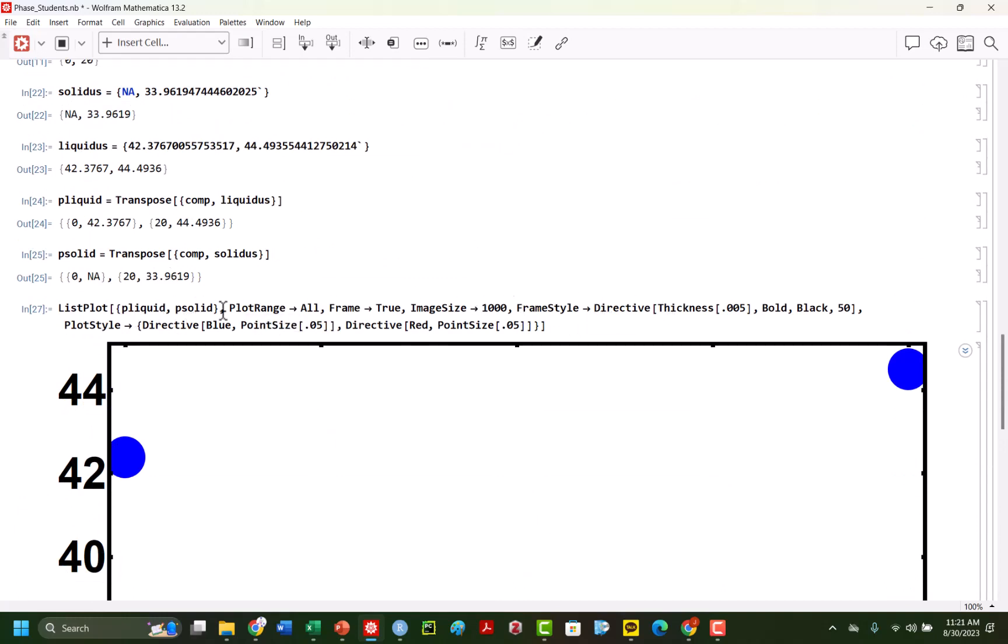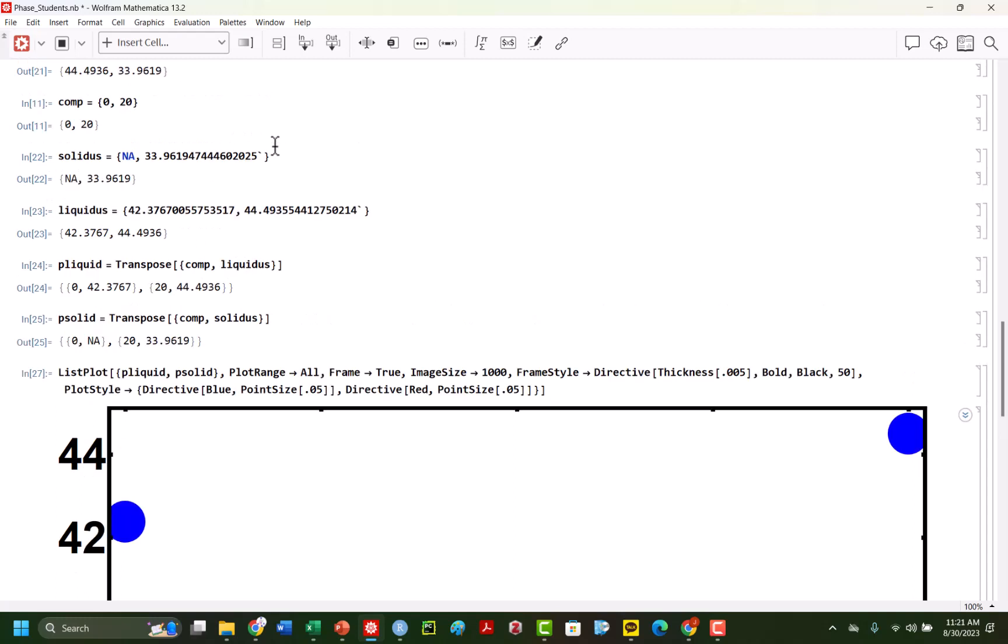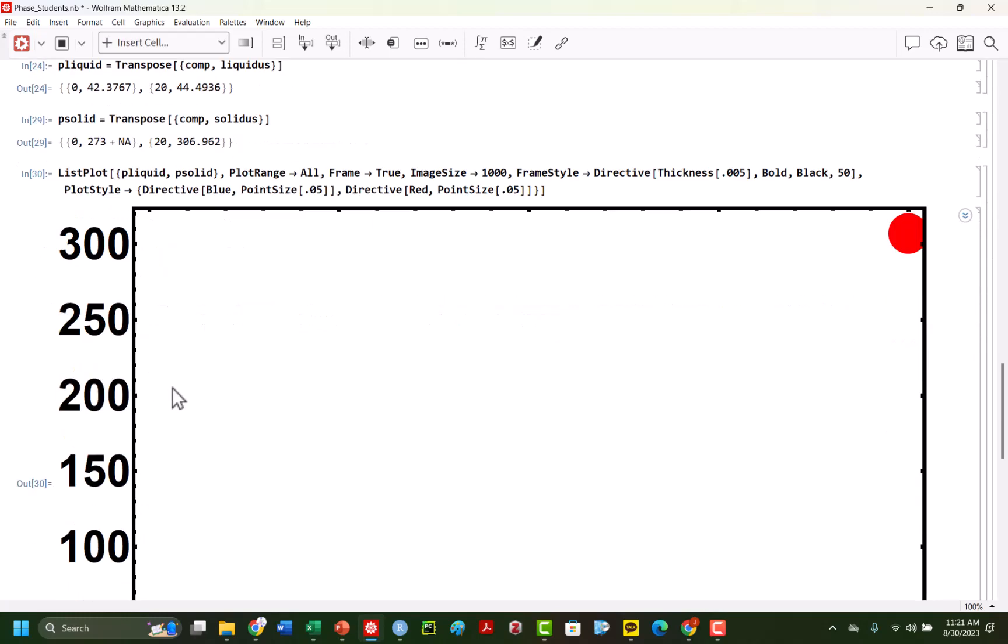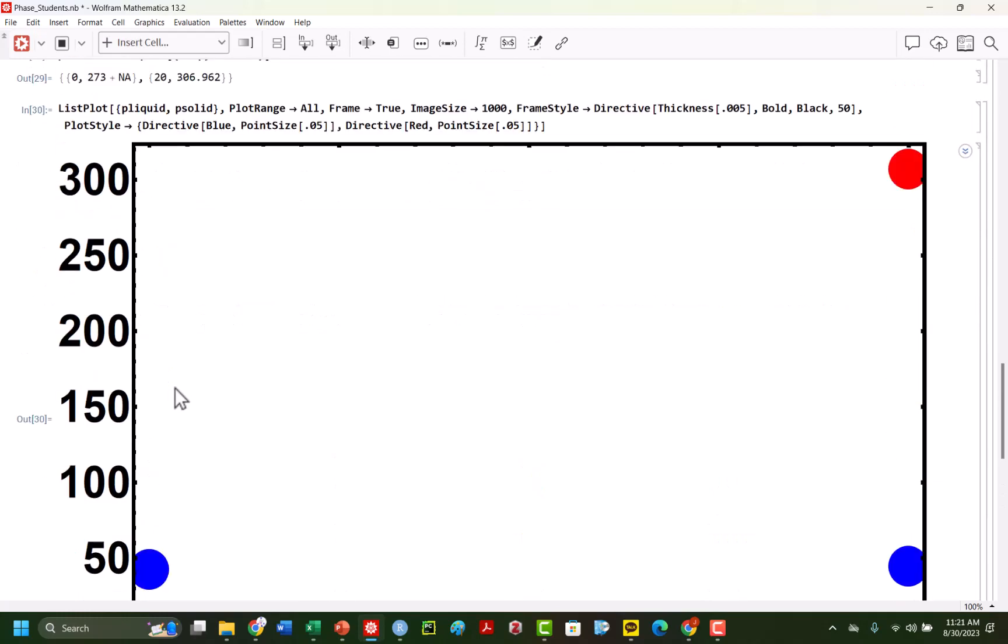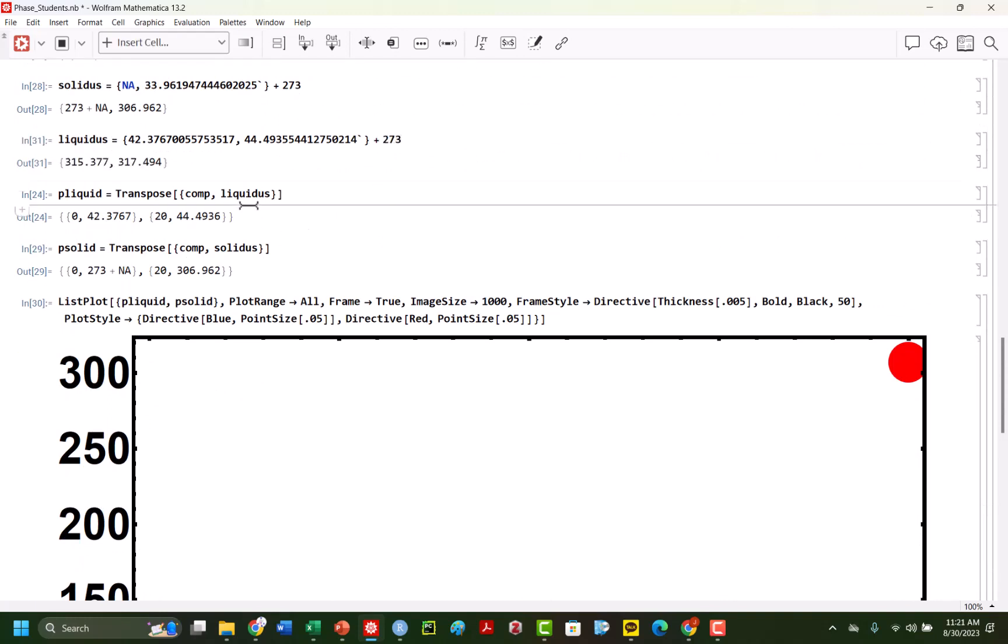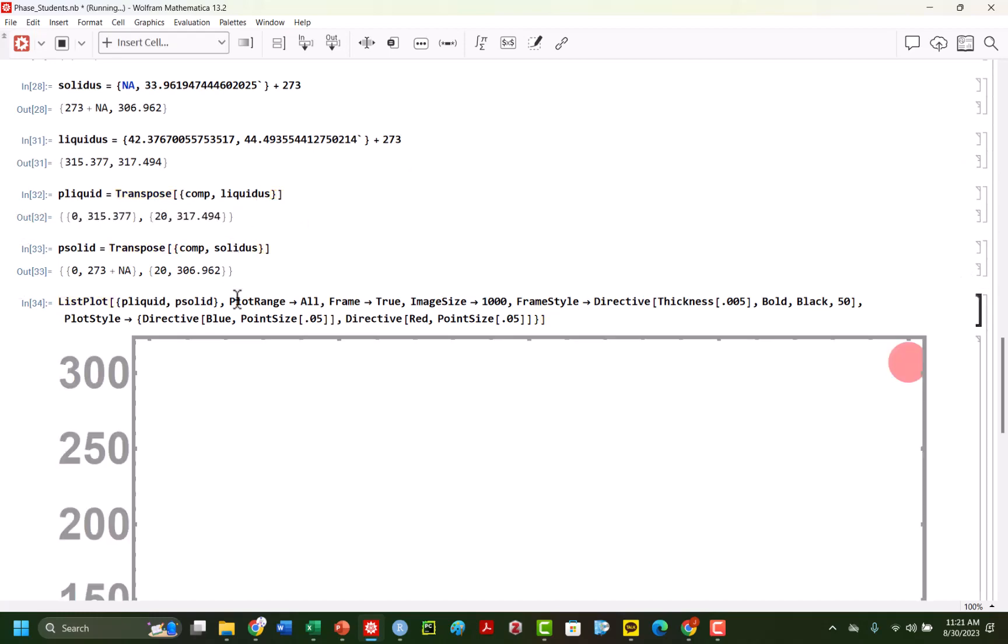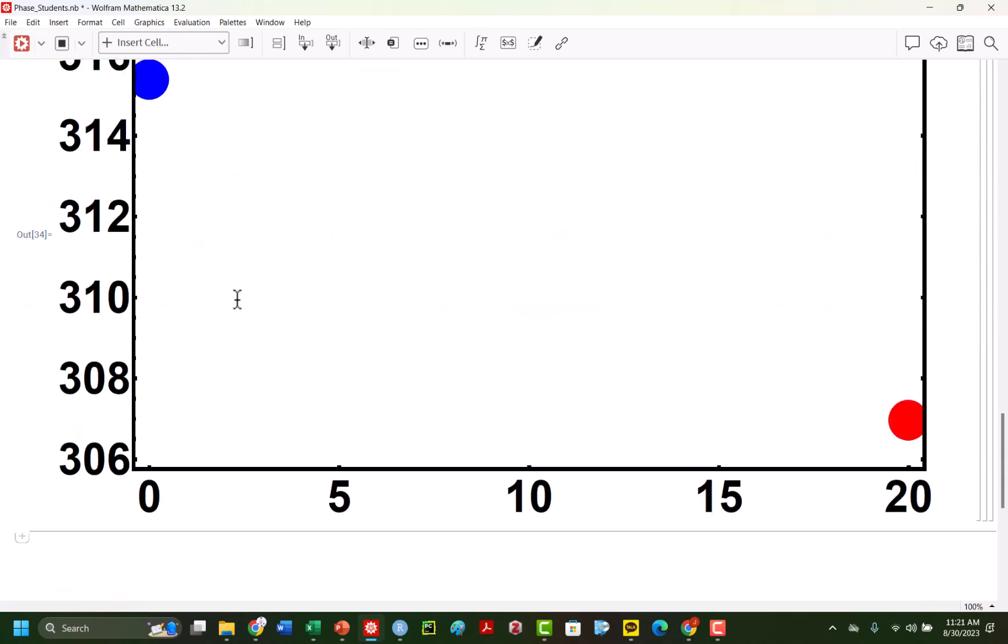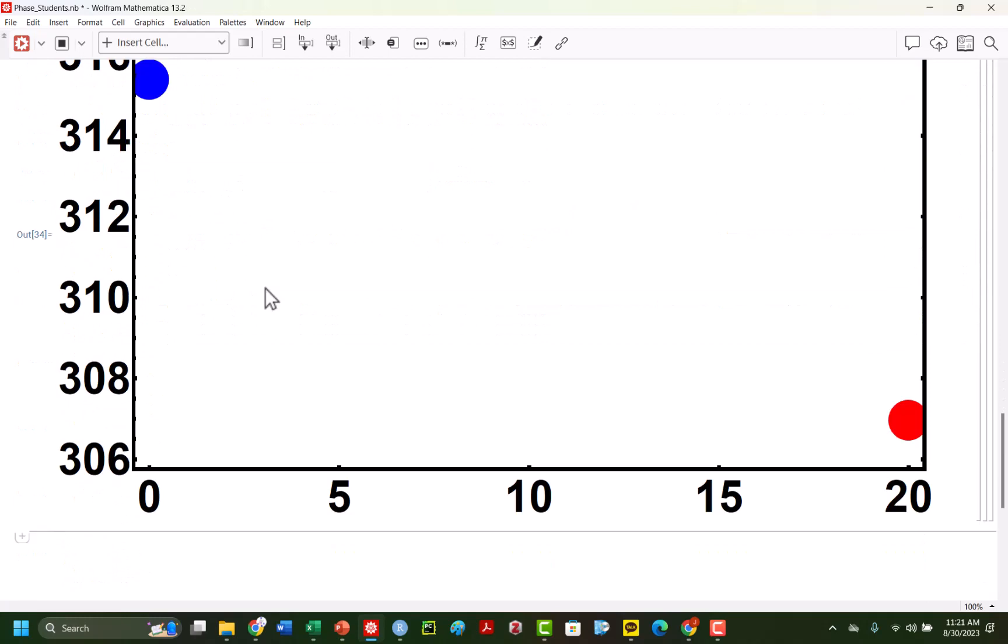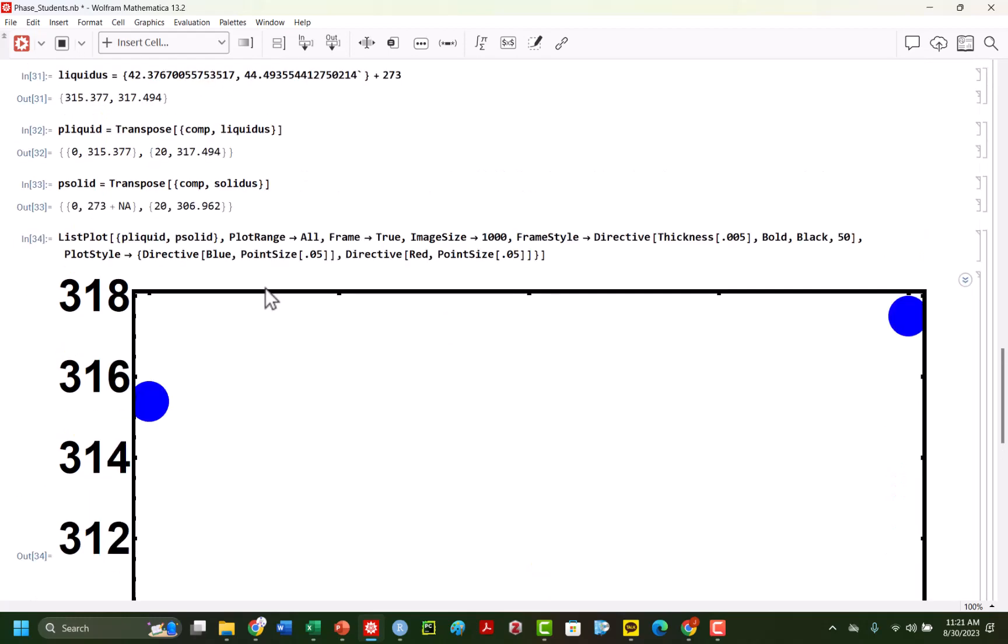and it may be good. Thinking of, you may actually, let's, let's put this in Kelvin. Let's see if this works. Okay, it still works, even though the NA is there. You may think about putting this in Kelvin, just because that's our standard SI definition. Well, let's take care of these, these things. Fantastic. Excellent, excellent, excellent.